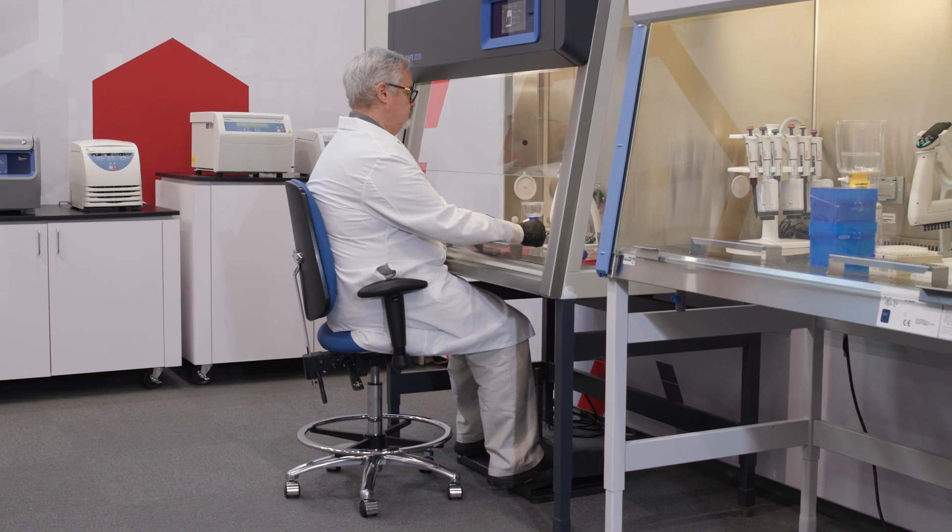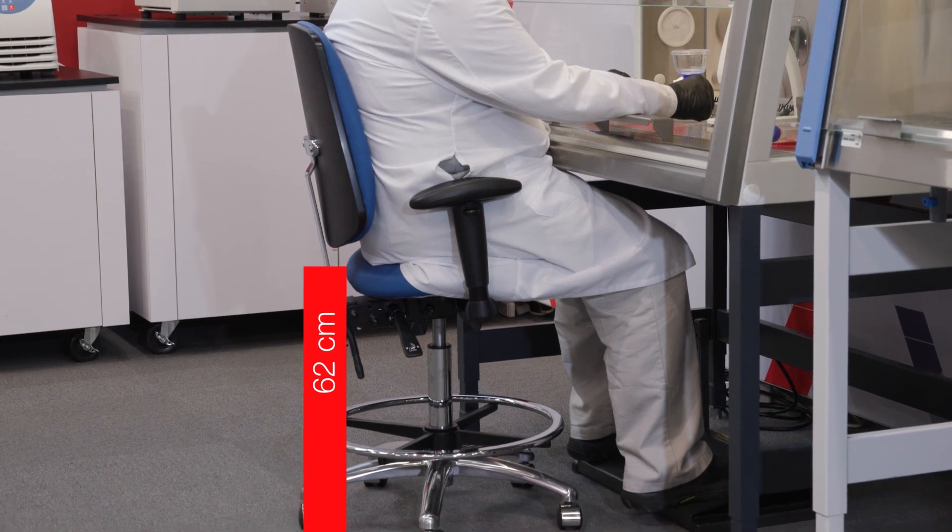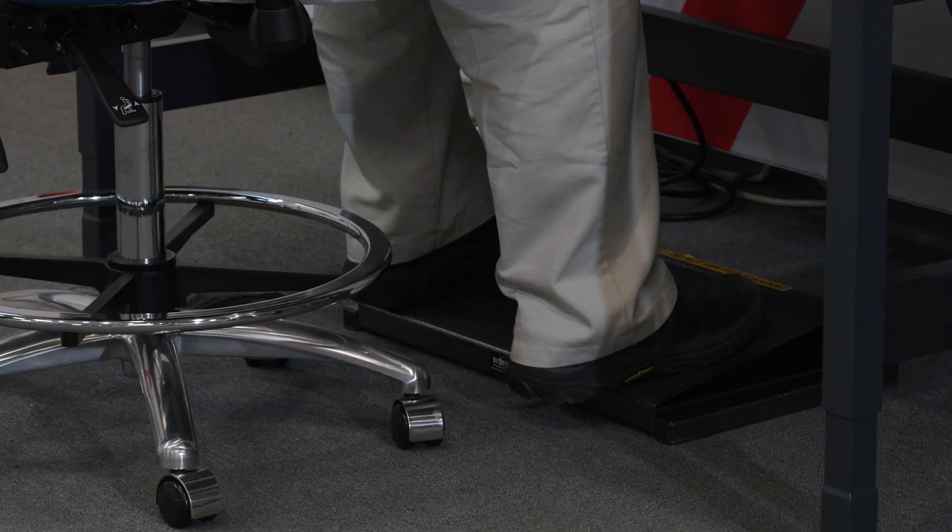Dave can also sit at the cabinet set for Aaron. We simply raise the chair height to 62 centimeters and add a footrest set at 8 centimeters.